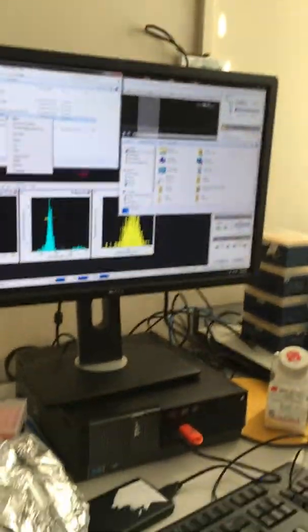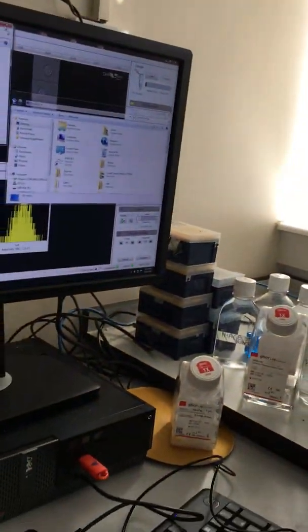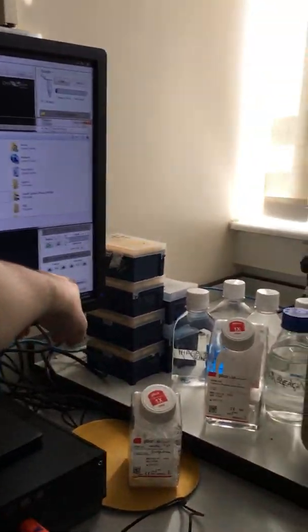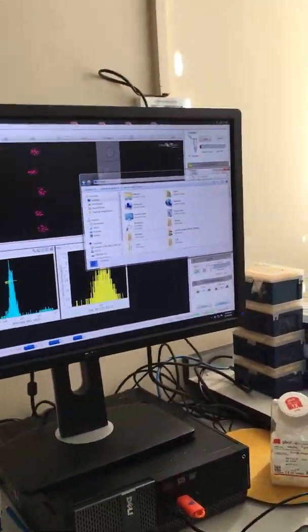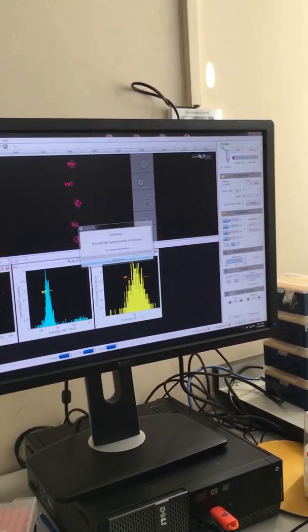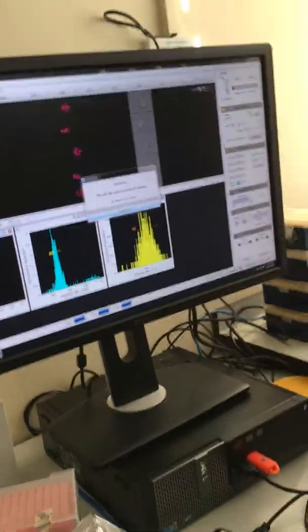Okay, and now you're going to hit shut down. So leave it there. Okay, and then hit shut down. That's it. Hit OK, and we walk away.